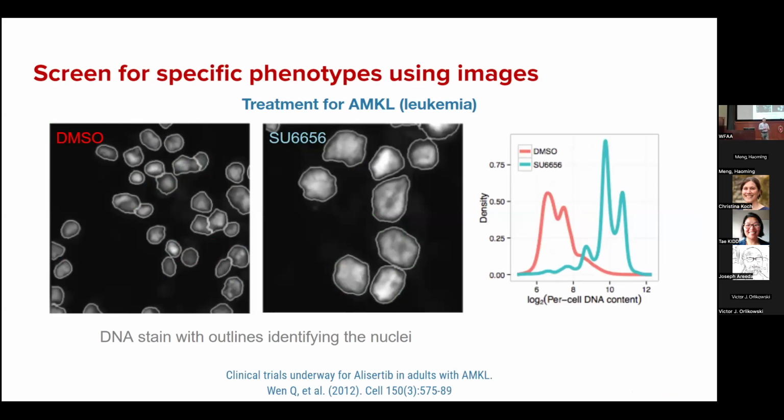So they were studying leukemia. And what they wanted to do is to identify one chemical compound that was able to transform sick cells into a more healthy state. And the phenotype that they identified as useful was cell size. So in this case, we see control cells. Cells here are sick. And these ones are kind of healthy cells, and they are under this specific compound. So this is a chemical compound that was applied to the cells. And you can see the difference in size. It's just the major phenotype that biologists want to recover in this specific experiment.